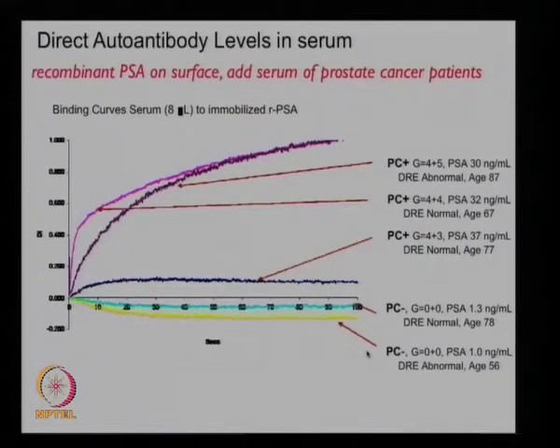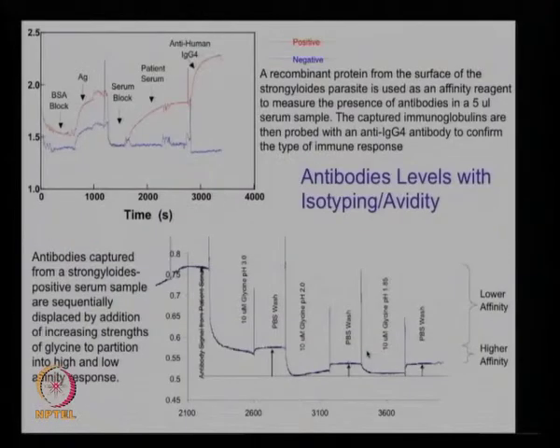Sure. There are various applications that different groups have studied, and this is about detection of PSA. And some interesting work was done on antibodies for isotyping and avidity experiments. As I said, once the instrument is commercial, I don't even know what these things are anymore. Obviously, it's just measuring interactions of different biomolecules, and one can use the same principle.